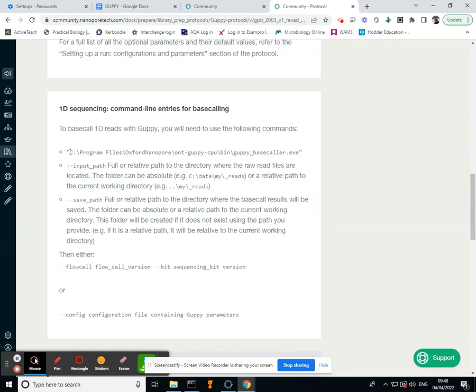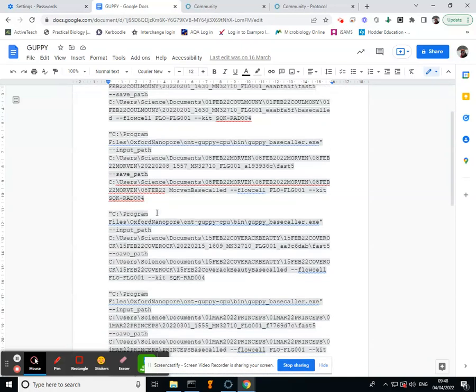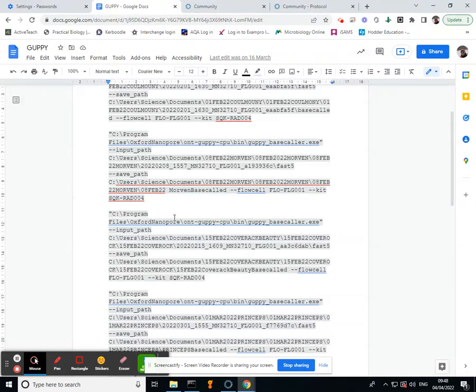What I generally do is I make a little Word document or a Google Doc with each bit to go through, because that's going to enable me to check before I paste it into the command line.